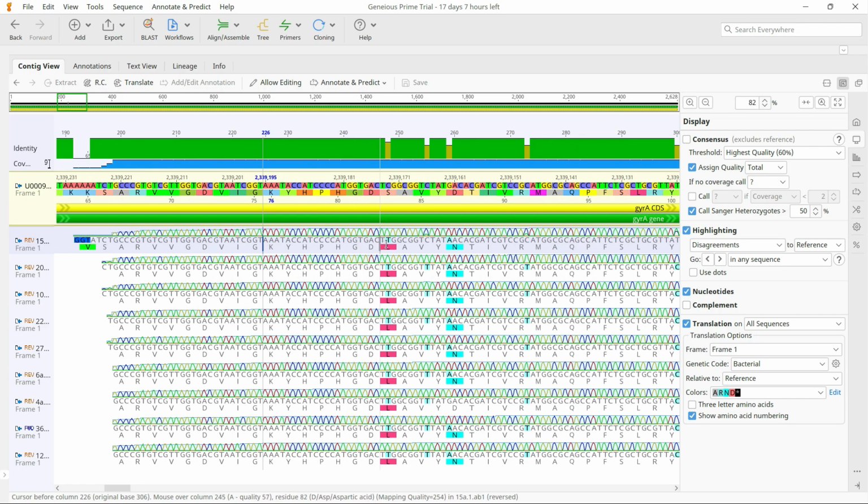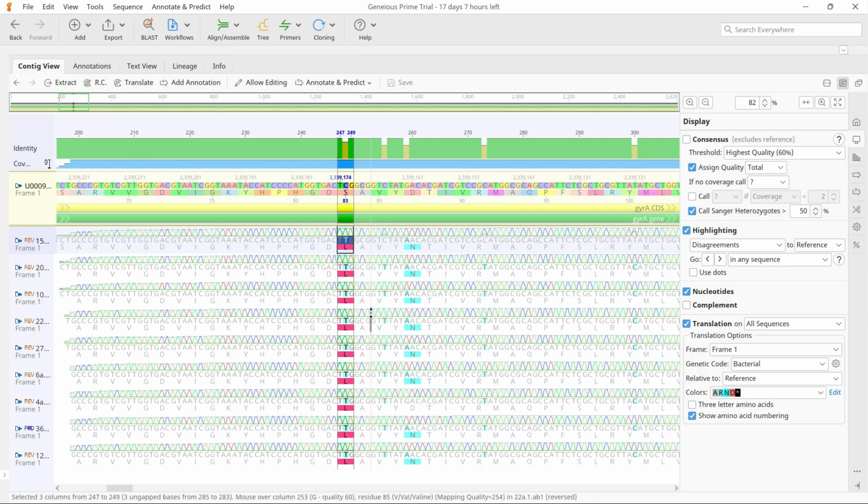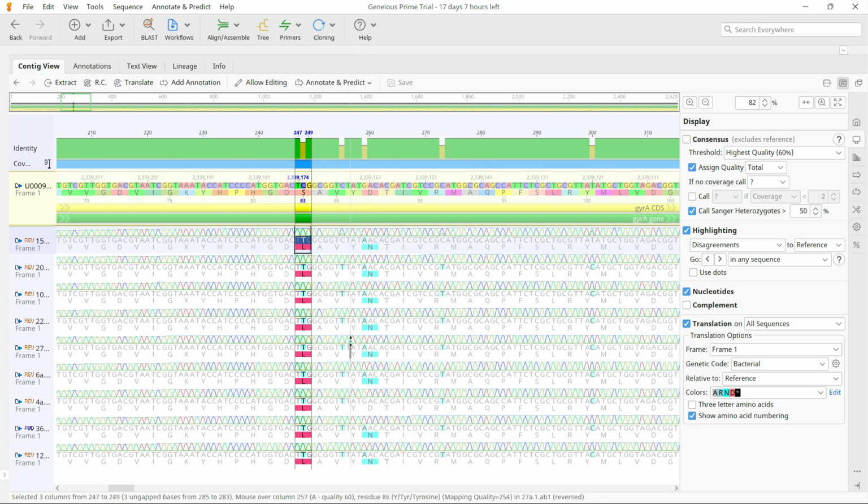But as you are guessing, we will deny this because of quality issues. In the reference sequence, the amino acid at position 83 is serine, while in the sample sequence it is leucine. This mutation at position 284 of the sequences is therefore a missense mutation.